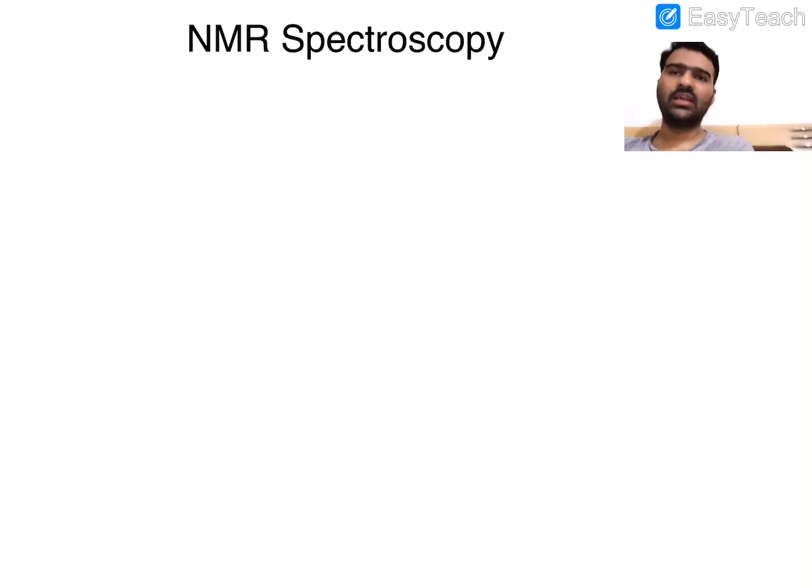These concepts will be expanded a little further through the video. But what is quite important to look at is that the difference between these frequencies is not very large, and we established that towards the end of the previous slide, wherein we said that the differences between the resonant frequencies are only of the order of certain ppm.